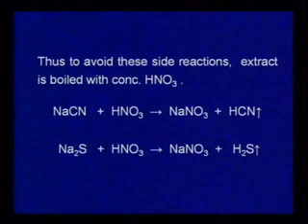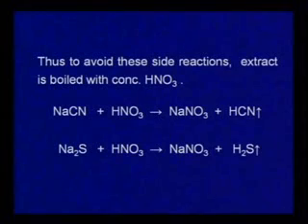Now, what is the role of concentrated nitric acid here? Concentrated nitric acid decomposes sodium cyanide into hydrogen cyanide, and we know hydrogen cyanide is a gas, so it will easily be removed from the system. Similarly, sodium sulfide gets converted into hydrogen sulfide, which is again a gas, so it can be easily removed from the extract.